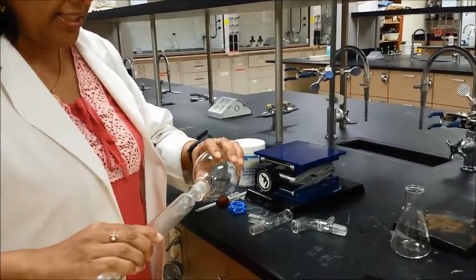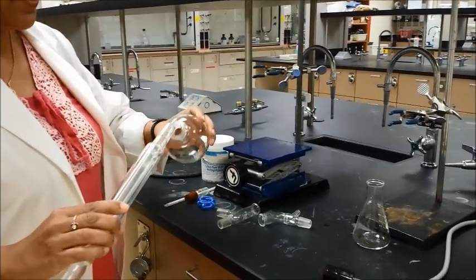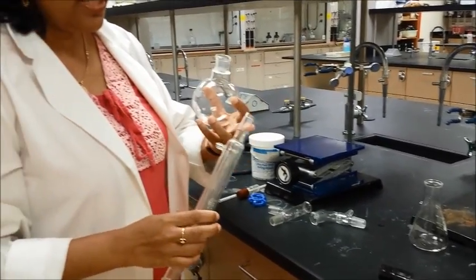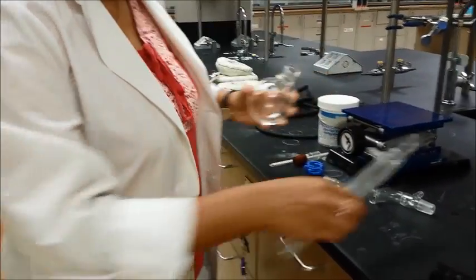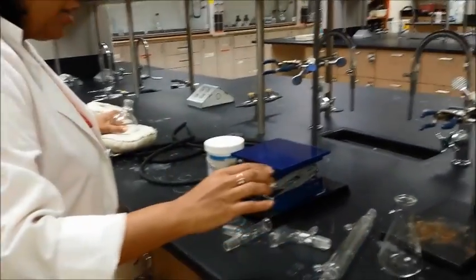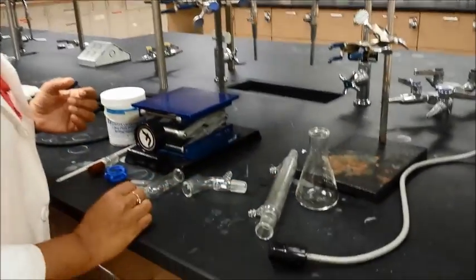Make sure things don't get stuck. If they're getting stuck, you need to grease it just a little bit. You will have grease in the lab, so you just grease slightly on it and then twist it around to make sure everything is nice and smooth. Don't use too much, otherwise it will get into your reaction system. So this is the condenser that you need.